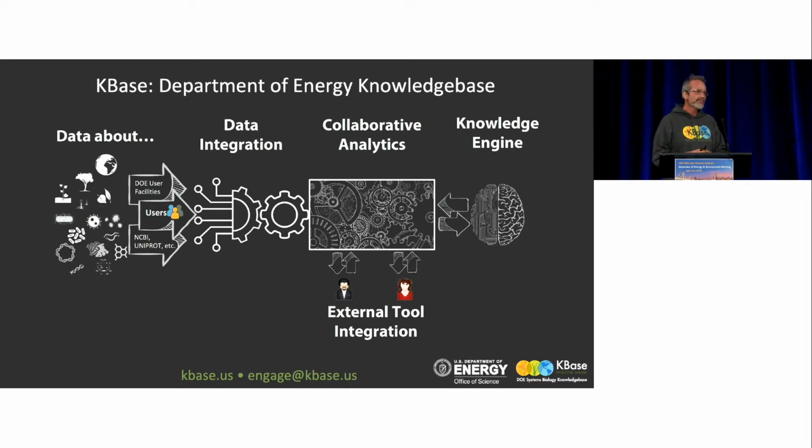Part of the special sauce of the system, however, is something we call the knowledge engine. What this thing does is it relates what you have analyzed and what you have shared with other data on the system. Now, KBase's basic premise is your data is yours until you share it and hit the share button. And once you do that, then for the people who have it shared, they know how to relate their data to yours and what other data which is public that it relates to. You can get to it. The knowledge engine gives you inferences based on the information.